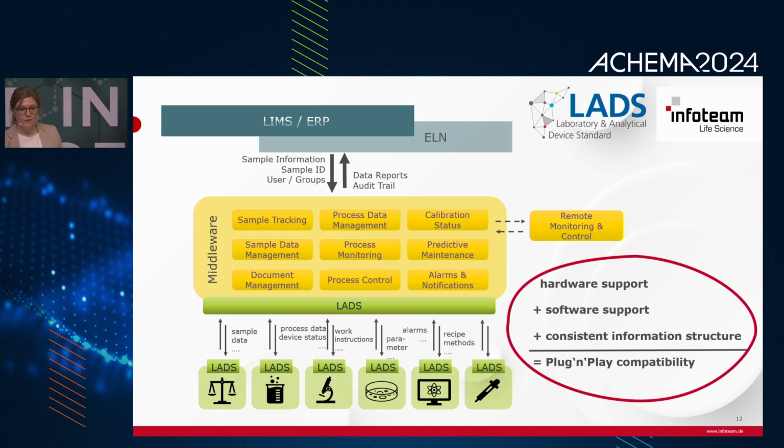And if you have a little bit more sophisticated middleware, you can also do process monitoring, even remote monitoring and control. Also receive alarms and notifications, perform data analysis for predictive maintenance, and so on.